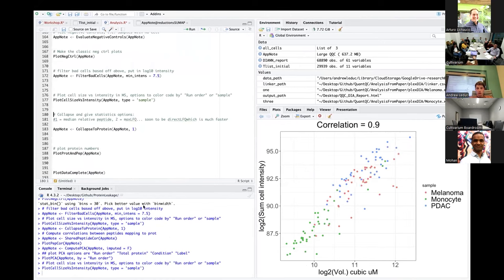Okay. So if we look at this, I can zoom maybe, or maybe it won't let me. Oh, yeah, but you see, the green, there are big green cells up here all the way down here, or even the blue cell. And this axis is log two volume. So a red dot here and a red dot here, there's a 2x difference in volume.